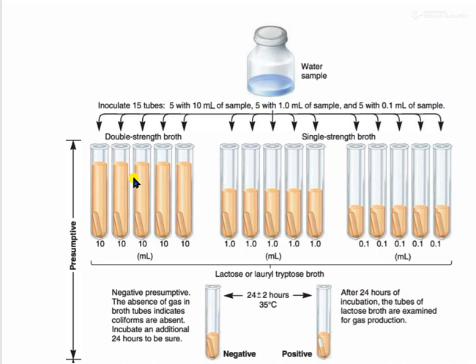Now you might have a doubt, what is double strength and what is single strength. Just think, if I am saying you need to prepare a glass of Complan with 1 spoon of Complan in it, that is single strength. I'm just telling you in layman's language, okay?